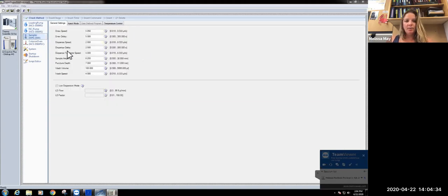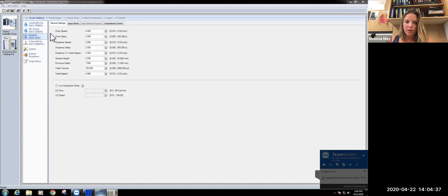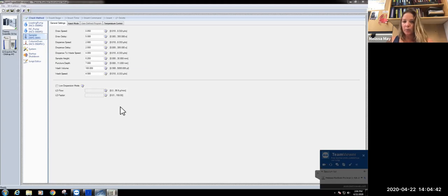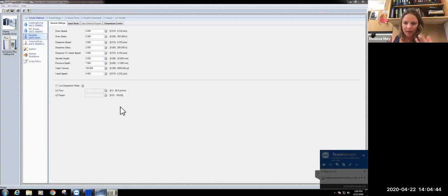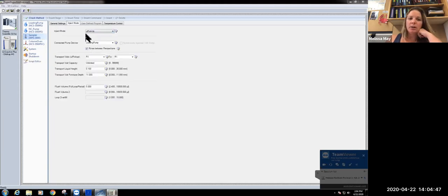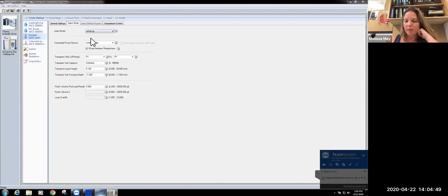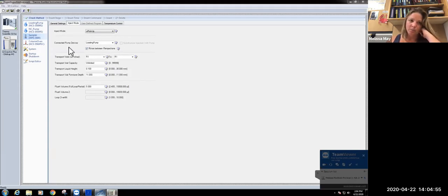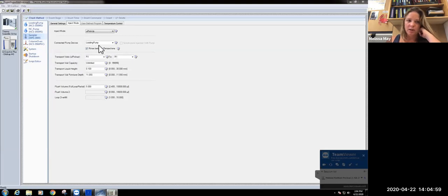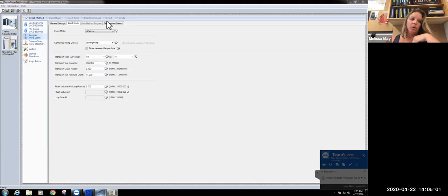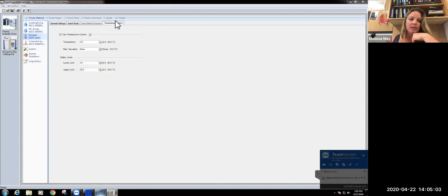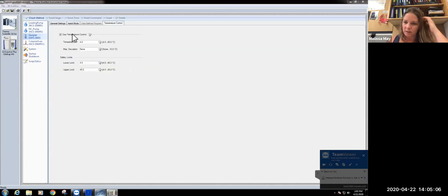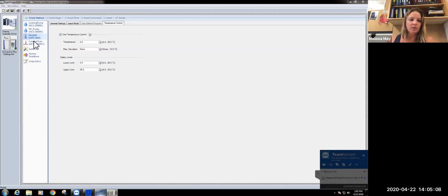In terms of the sampler, for the vials that we use, these are the actual parameters with the puncture depth and sample height that you would want to use if you were setting up a new method. We do one microliter pickup, which means that one microliter of sample is going to be loaded in with 19 microliters of loading buffer. That loading buffer is coming from our transport vial from the loading pump. We have our samples held at four degrees because oftentimes we have multiple samples sitting in the chamber.